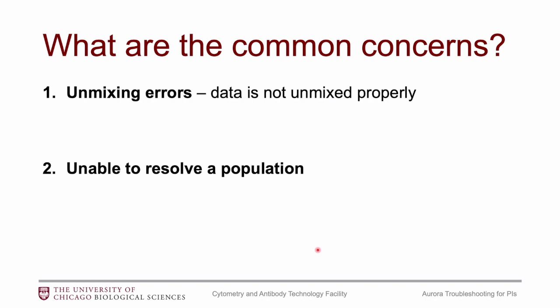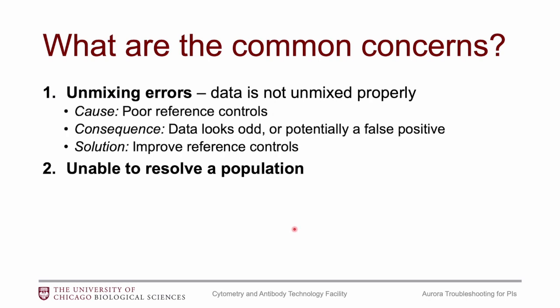On to the common concerns — these two concerns are something I ask all of my users to always be looking for. The first has to do with unmixing. Just like you want to check compensation on a conventional cytometer before analyzing data, you also want to check the unmixing on spectral data. If the unmixing is incorrect, you could end up with data that looks odd, or potentially get a false positive. This all has to do with the reference control — better reference controls give you better unmixing.